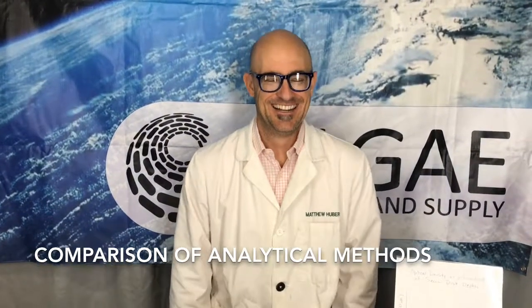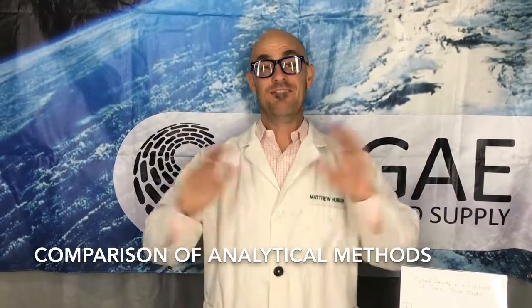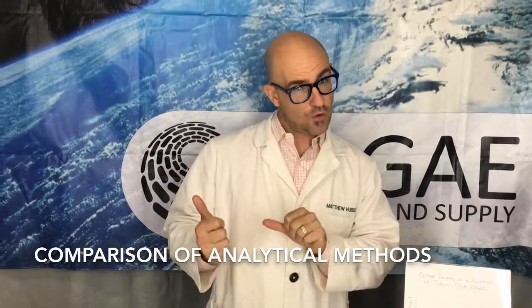Hi, this is Matt from the Dirty Lab Coat Algae Research Supplies video series. Today we're going to do something kind of fun, and this one is for more of the older kids.